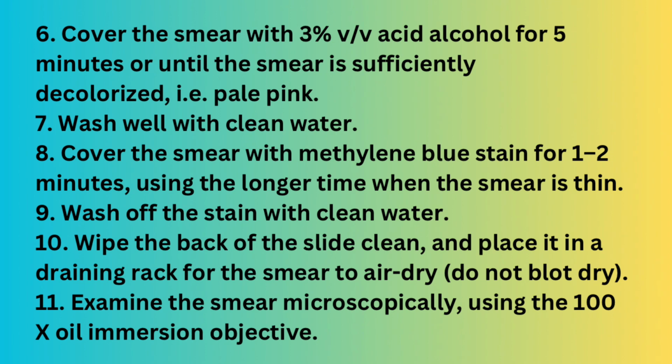Cover the smear with 3% acid alcohol for 5 minutes or until the smear is sufficiently decolorized, that is pale pink in color. Wash well with clean water. Cover the smear with secondary stain methylene blue for 1 to 2 minutes, using the longer time when the smear is thin. Wash off the stain with clean water. Wipe the back of the slide clean and place it in a draining rack for the smear to air dry. Do not blot dry. Examine the smear microscopically using the 100x oil immersion objective.